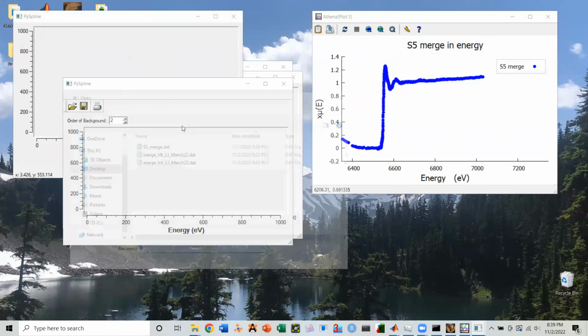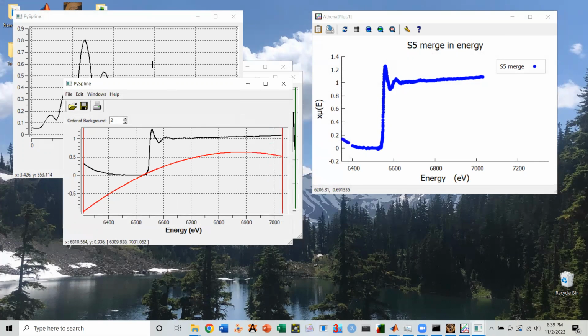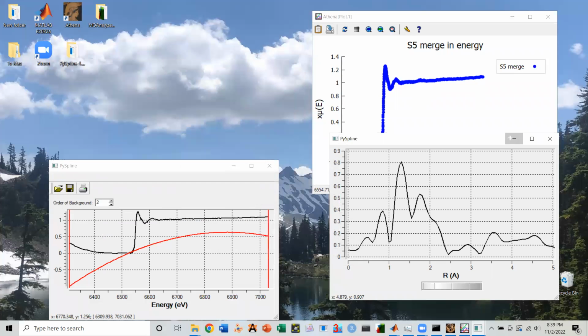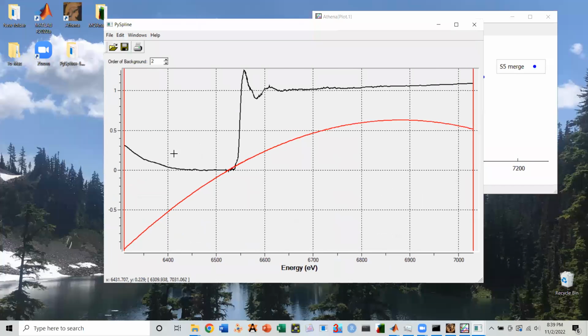Okay, now this should go more smoothly. Here we are. So this time I'm just going to use probably the default value for manganese because I'm not doing any XAFS splining here. So it doesn't matter what that is. Okay, so because I'm not doing that, I'm just going to minimize those windows and maximize this, so we only get one line here.